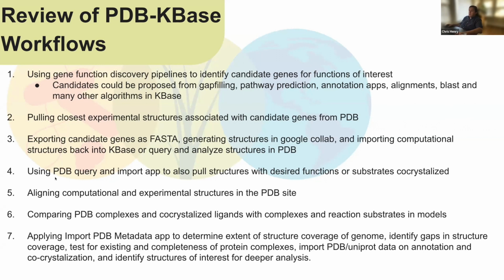You can do very rich queries, and I just encourage you to look at that app. And in particular, look at the PDB query, because the tools are very, very good in the PDB site itself, and quite capable of doing a lot. We only offer a subset at the moment in KBase, but I hope to keep building that out. You can align computational and experimental structures in the PDB site. And this is the big thing.